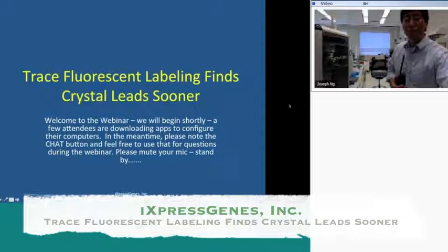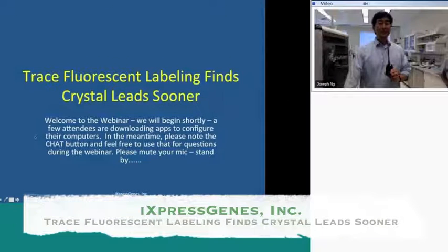My name is Joe Ng. For those of you who do not know me, I'm here talking to you live, broadcasting from the HudsonAlpha Institute. And here with me is Mark Pusey, who's on my left-hand side. You can see him. We're here to talk about trace fluorescent labeling and how it can help find early nucleations and ultimately the conditions to find crystal growth.